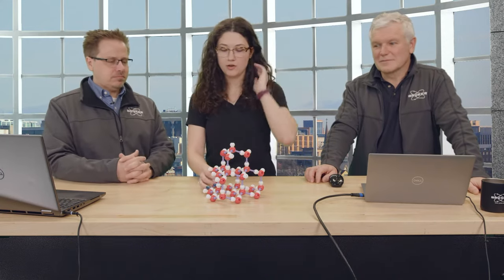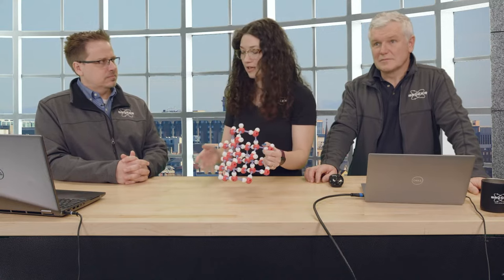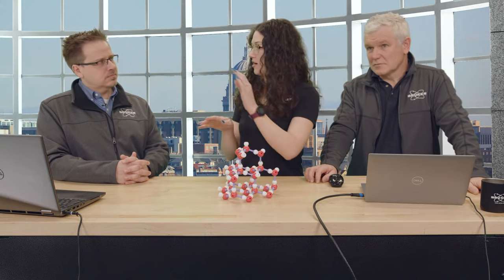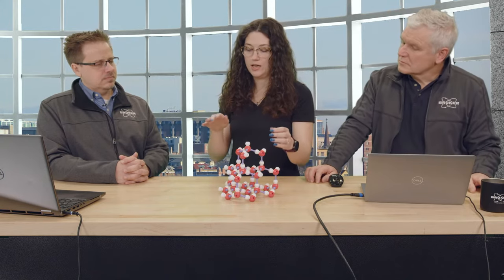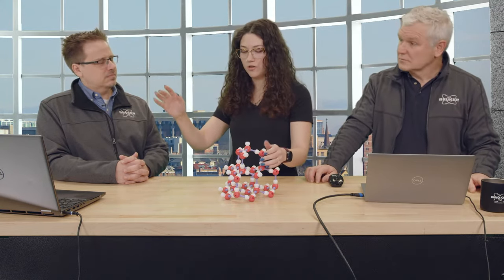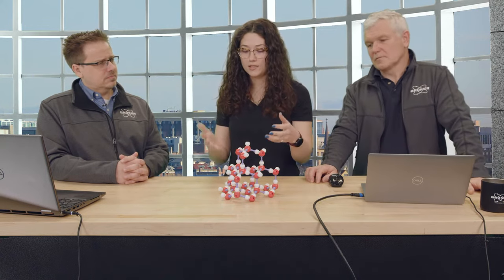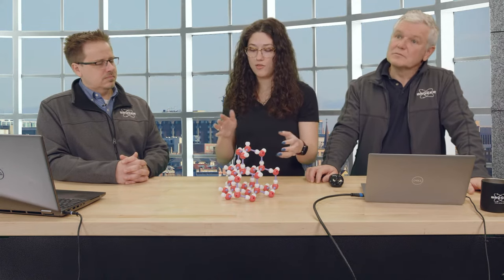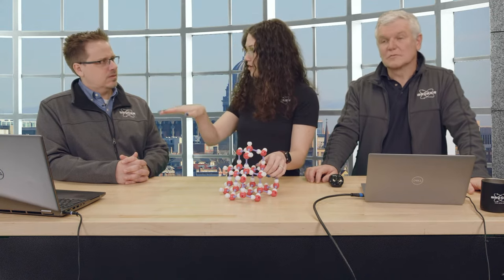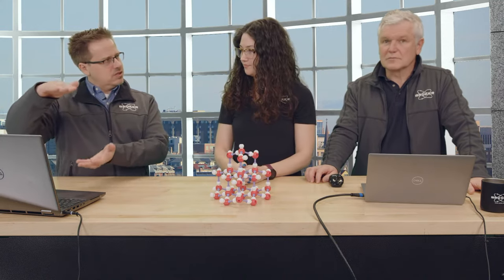Right. So if you think about little water molecules in their crystalline form, so solid water, ice. If you take this structure and you extend it for about a meter, and then you imagine walking across it, every step you'll have a depression, and where there isn't a step, it will be that same height. And that step will be at a regular interval, but you're breaking that translational symmetry. So we need another way to describe that repeating pattern, another dimension or Q vector, to describe that almost wave-like function of the changes in that structure. So the modulations, that's this deviation that is occurring.